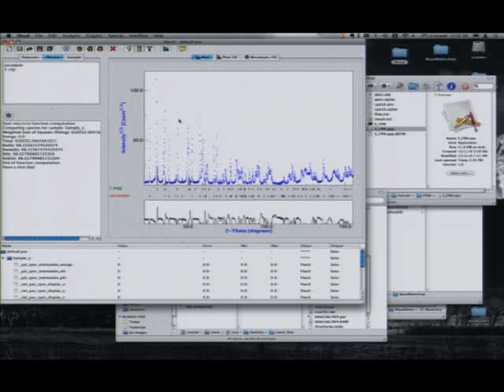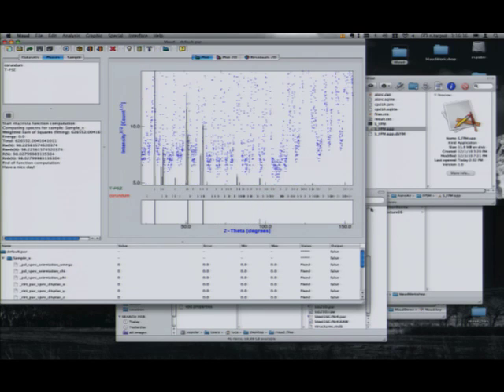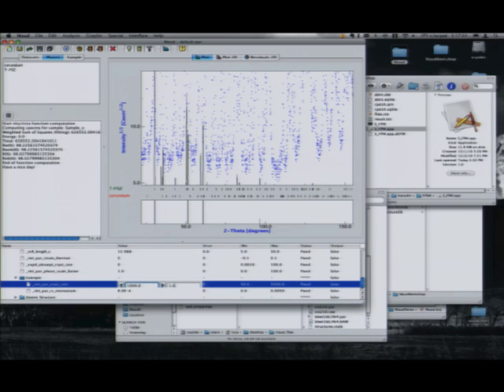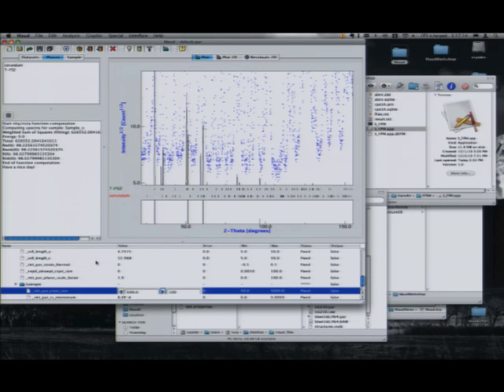Let's see. I just press the computation button over here. Okay, the intensity is very low. So then you want to change your parameters live. I just would like to show something. Isotropic here. If you want to change, for example, the crystallite size, let's put the step at 100, and then we decrease it. And actually, this appeared, what was this? The corundum.